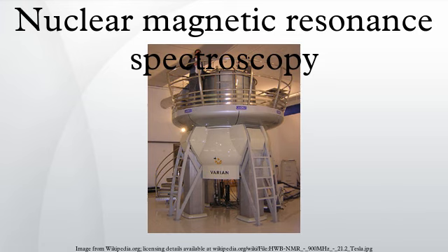Nuclear magnetic resonance spectroscopy, most commonly known as NMR spectroscopy, is a research technique that exploits the magnetic properties of certain atomic nuclei. It determines the physical and chemical properties of atoms or the molecules in which they are contained. It relies on the phenomenon of nuclear magnetic resonance and can provide detailed information about the structure, dynamics, reaction state, and chemical environment of the molecules.